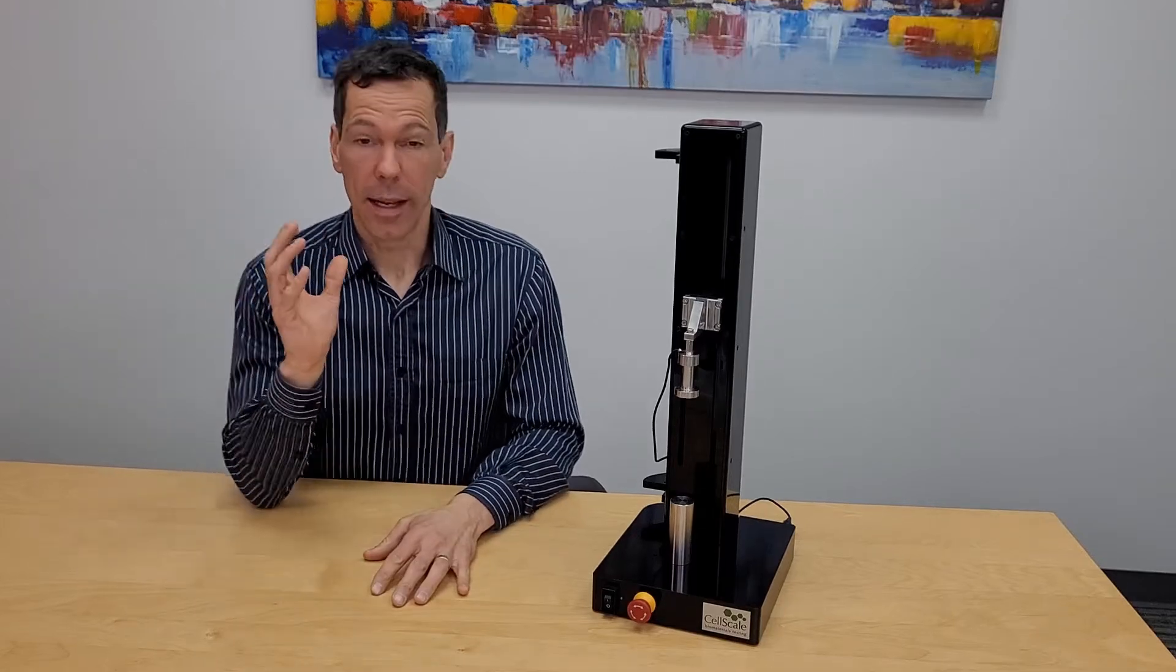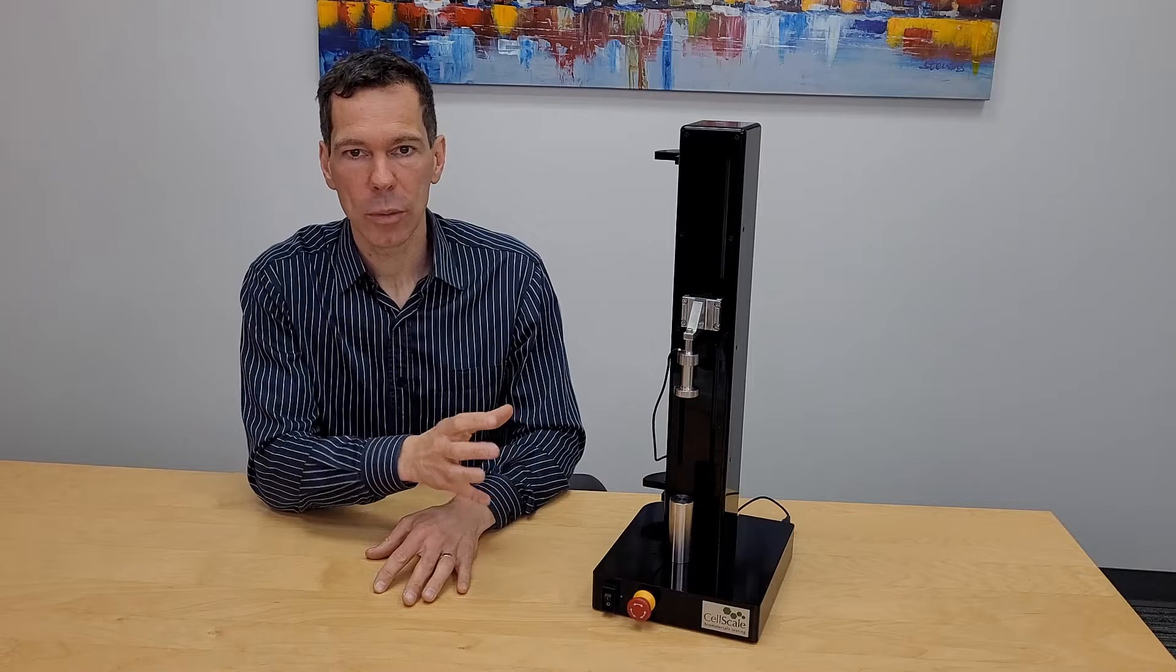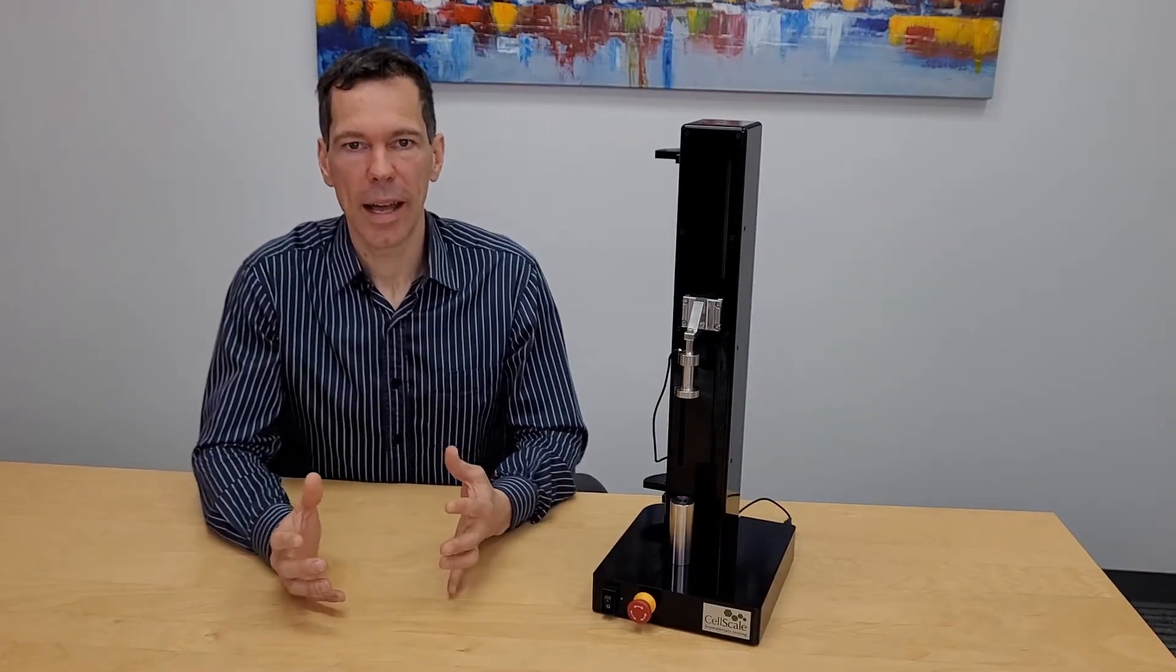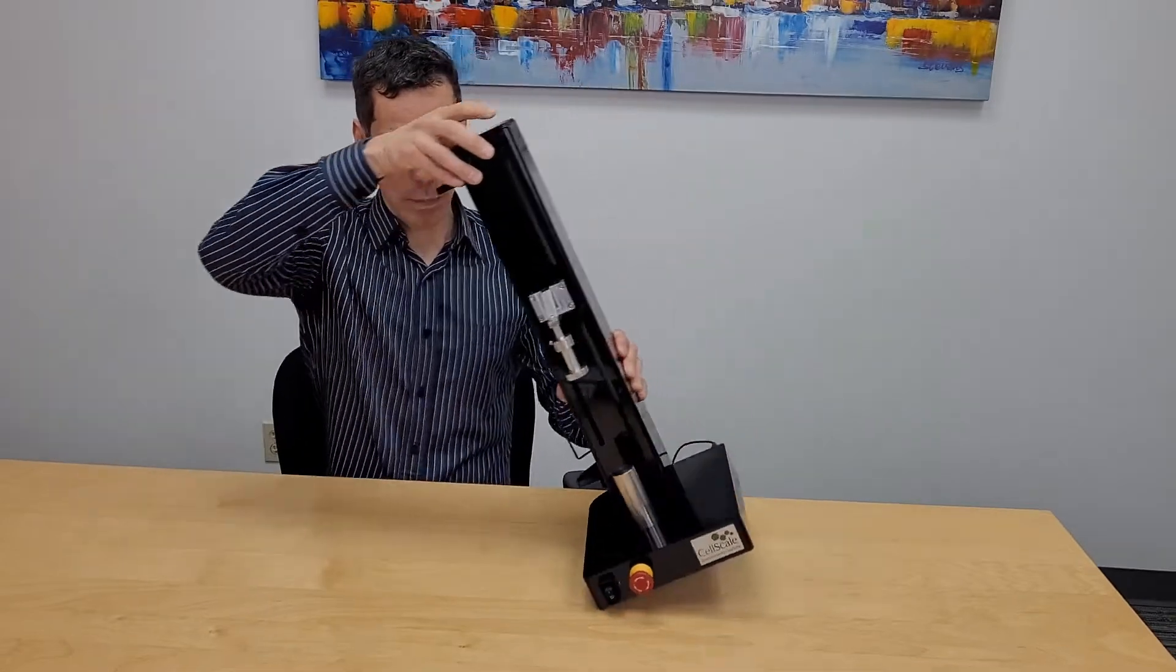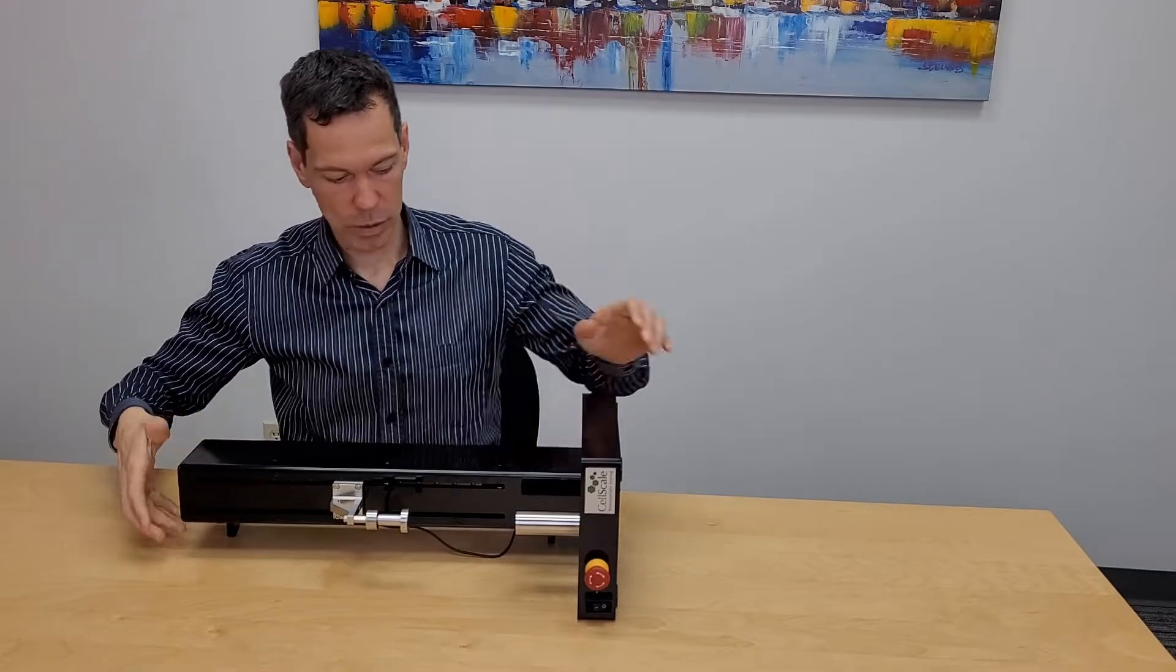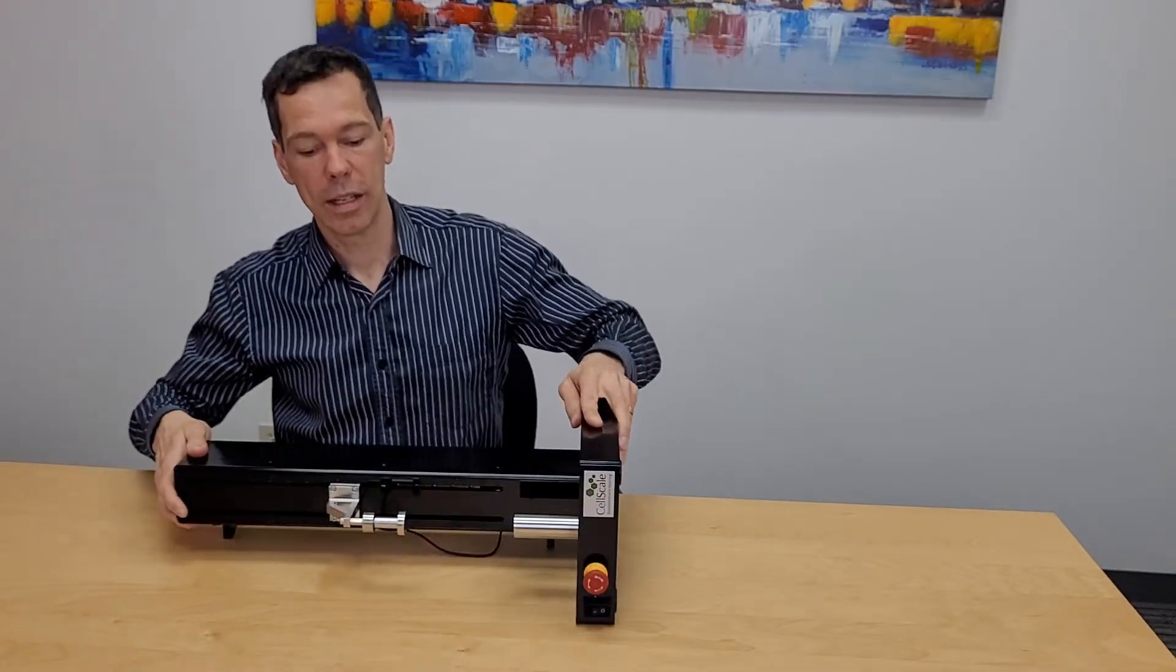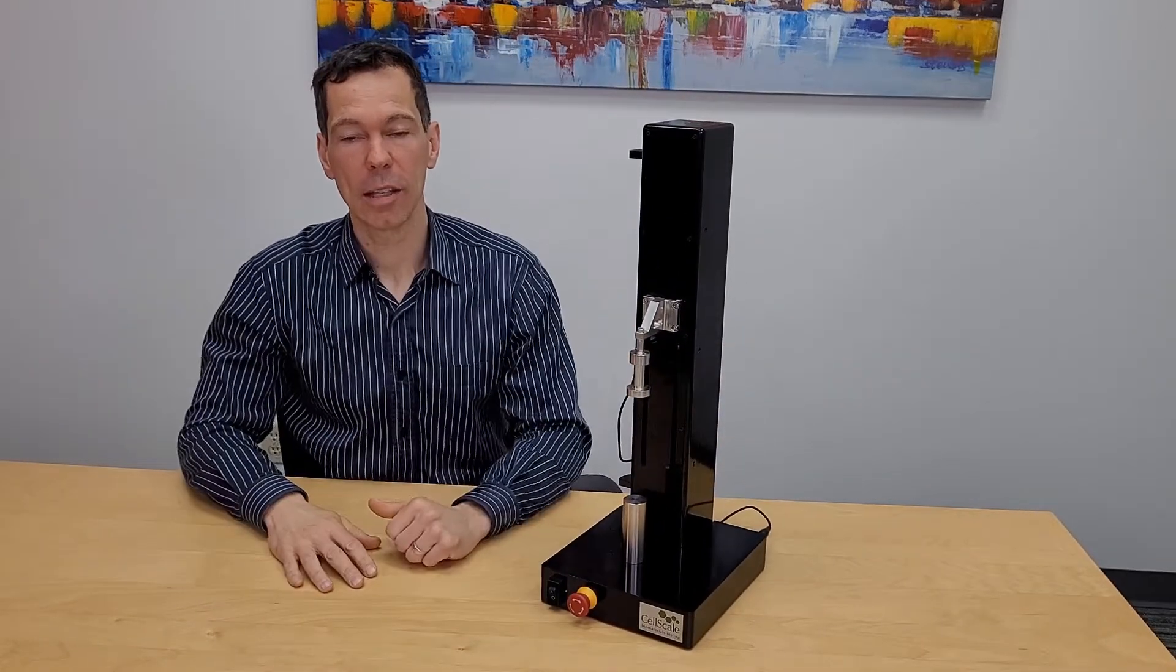You can add on the camera package that allows you to do DIC strain measurements. You can have a vertical or a horizontal temperature controlled media bath. You can run the system vertically or you can actually pivot the system so you're running it horizontally and being able to raise and lower your specimen quite easily out of a media bath. It really is a workhorse, a small but mighty system.